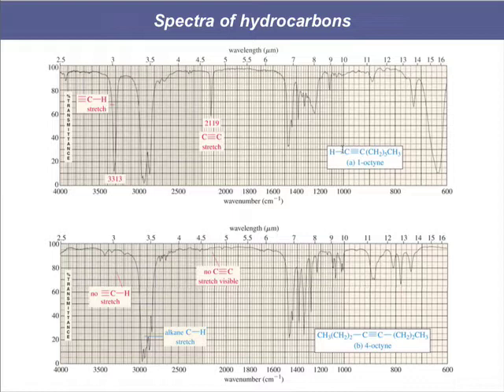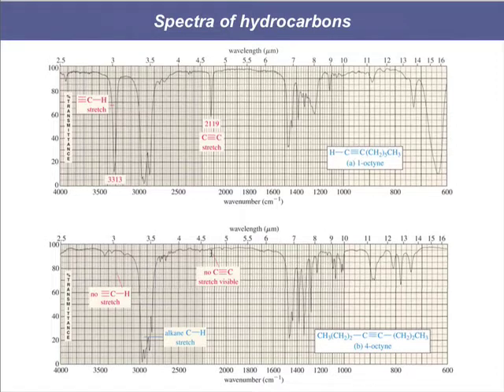When we compare 1-octyne, our terminal alkyne, to 4-octyne, which is not only an internal alkyne, but it's a symmetrical alkyne. Notice that in 4-octyne, we've got the same thing on one side of the triple bond as we have on the other side of the triple bond, which means that this is now an IR inactive alkyne. We do not see its vibration. The 2119 peak is gone.